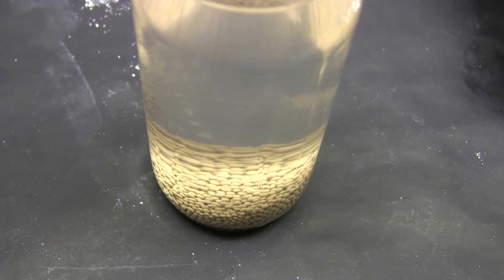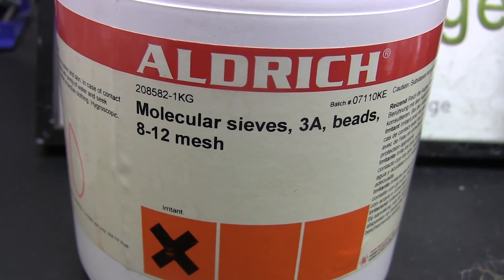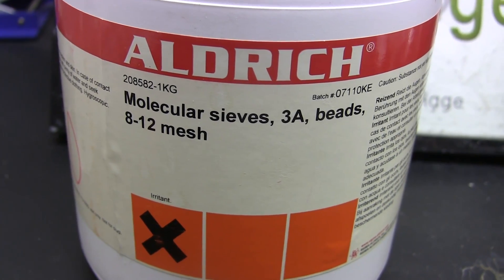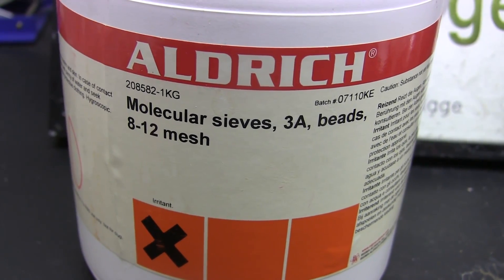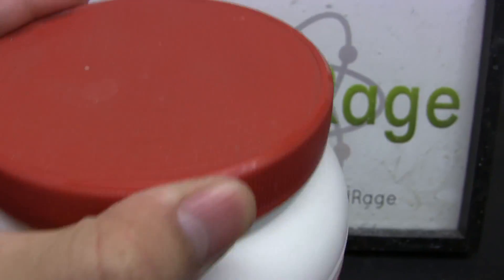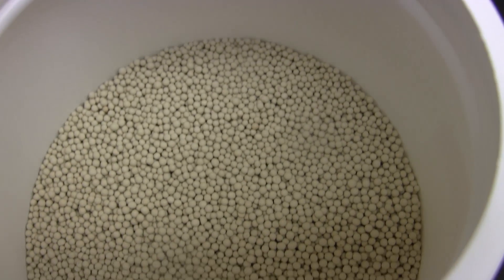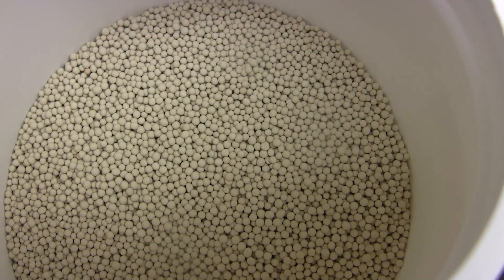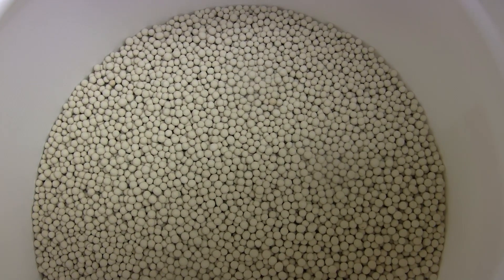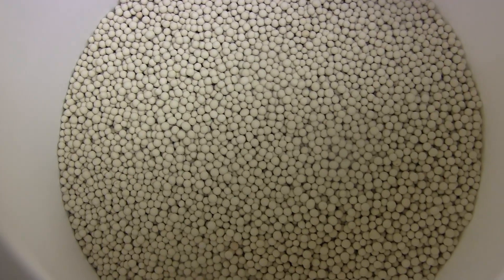Now we're going to do absorption drying with molecular sieves. I'm using the 3Å type, which means it has pores that are three angstroms in size. This might seem exotic but it's pretty easy to buy on eBay and other online stores and is relatively unrestricted. These are a type of zeolite or aluminosilicate clay engineered to have pores of a regular size. Molecules smaller than those pores — like water — wriggle in and stick, while bigger molecules cannot fit and just pass right by.